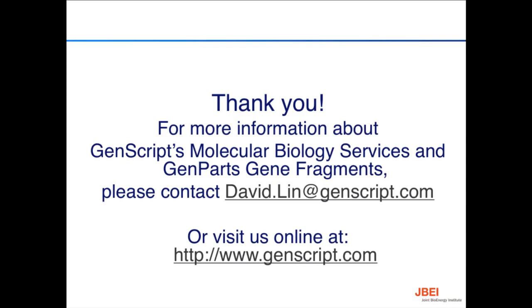Maybe with companies like GenScript, you could actually just order the fragments with the flanking homology and all of the sequence diversity in there too. So I think there's a variety of things you could do. Yeah, that sounds like he has a lot of options.